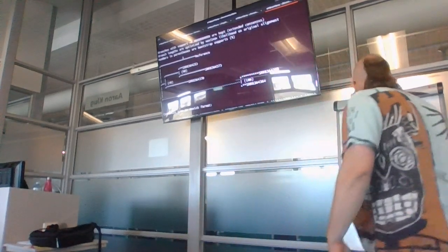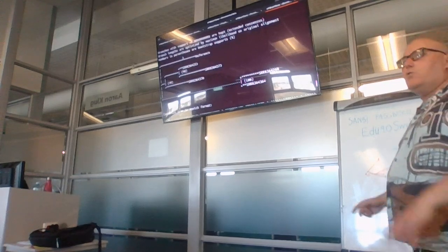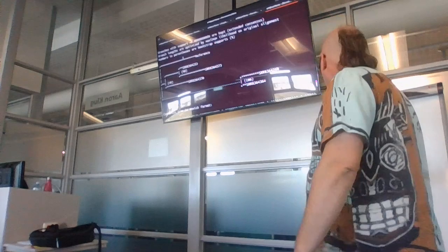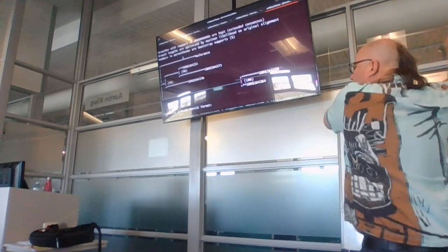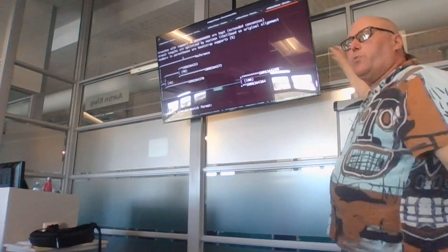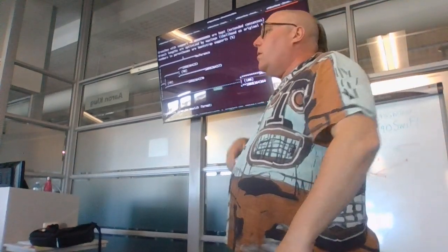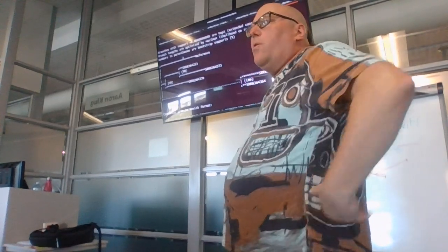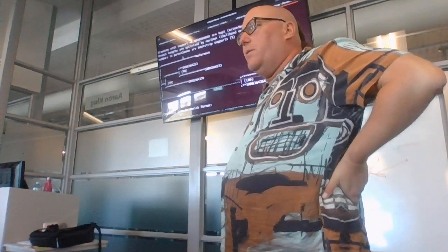That's where this long branch problem comes in. If I don't analyze correctly, so if I include poor quality data and I have many apparent mutations, then it will shift me to the right. I will get a long branch. Tracy had that example where there were some organisms that were not Vibrio cholerae in the data.